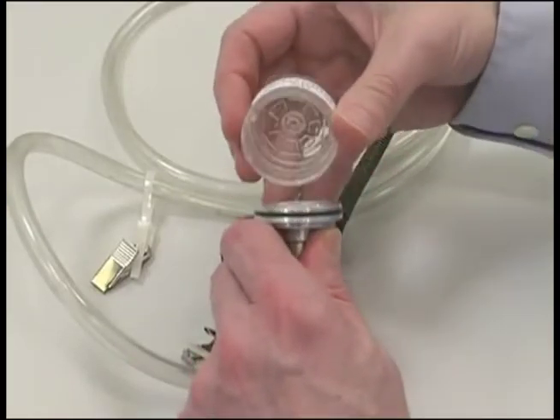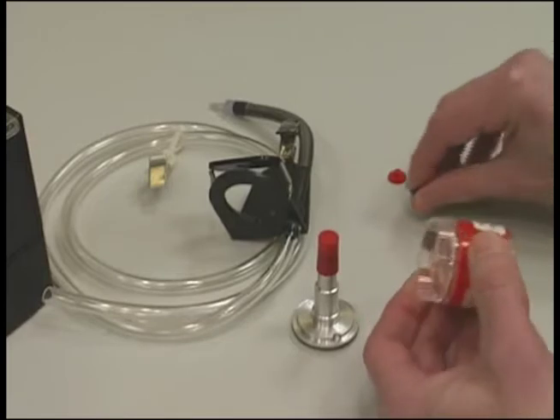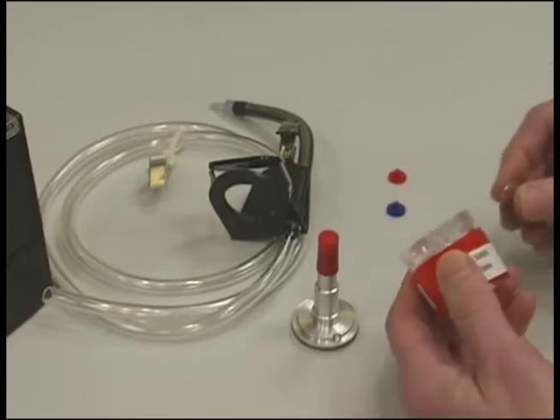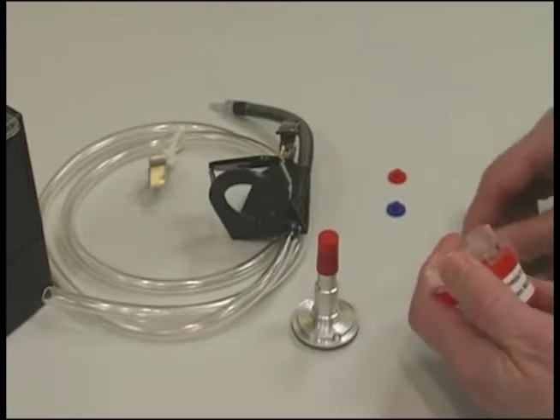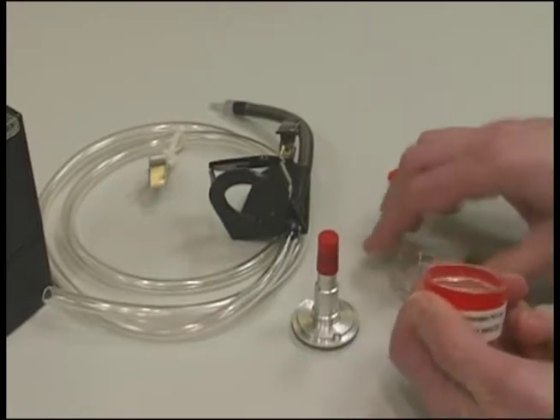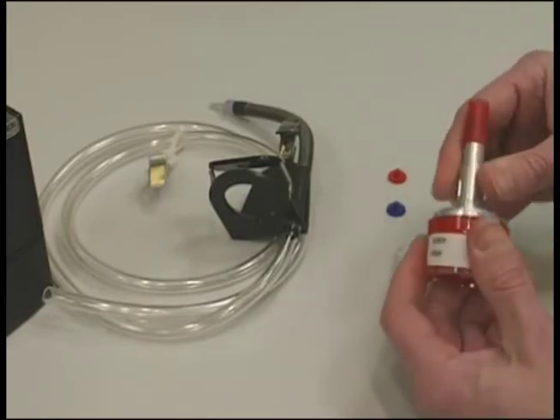Remove the shipping spacer from the cyclone, and then remove both colored nibs from each end of the cassette. Do not remove the red grit pot part of the cyclone. Remove the top piece of the cassette using a cassette opener or a coin, then insert the cyclone into the cassette. The black o-ring will secure it in place.